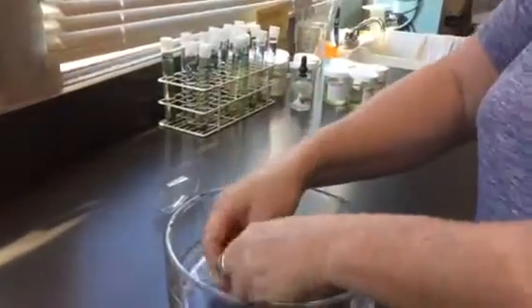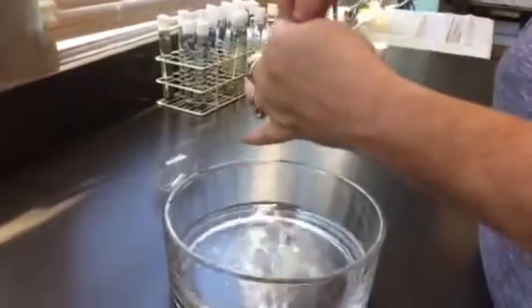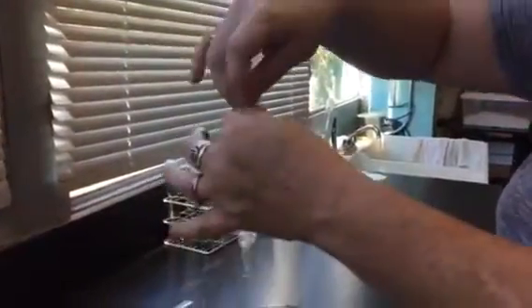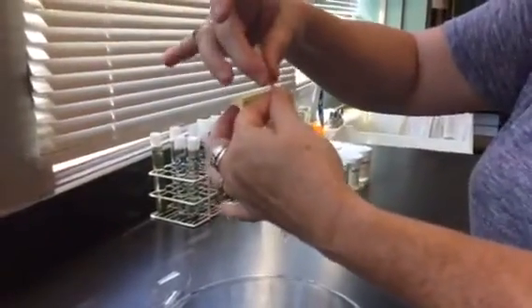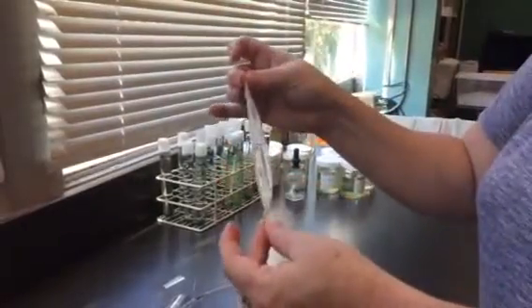Well, maybe I'm not going to fill it up easily. All right, but you can see that it'll hold water. Okay, so you can see the content. All right, and then what you're going to do is tie the other end. Now, when this bag is more full, it'll be harder to tie. Make sure you're careful to just use your fingertips and not your nails, because if it leaks, it won't work.